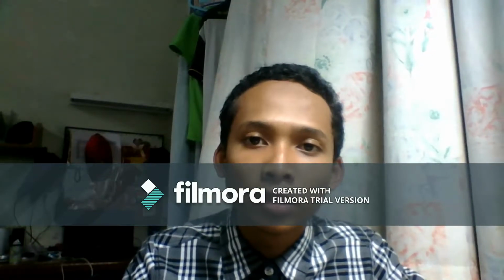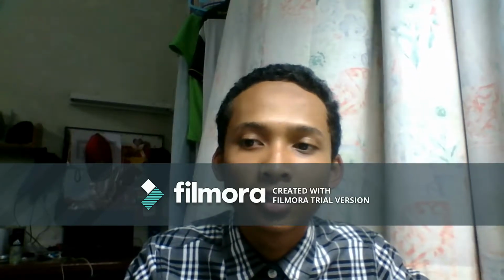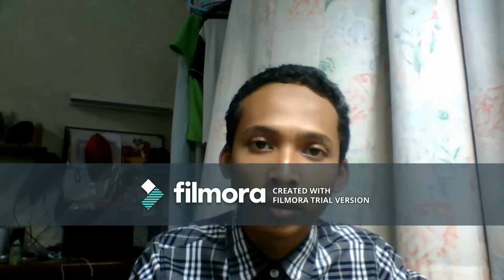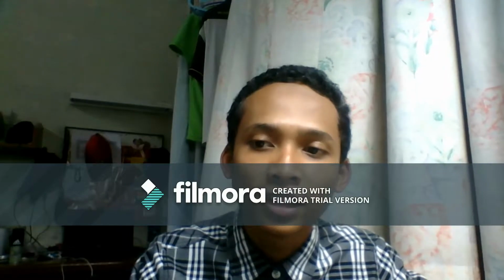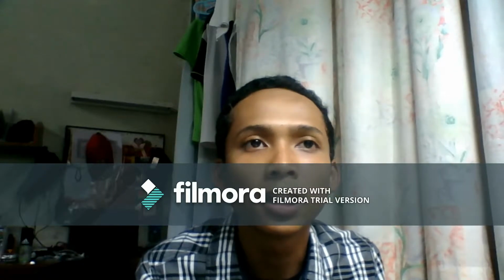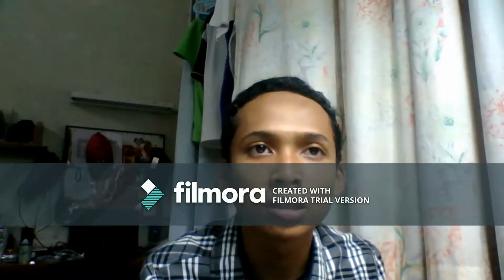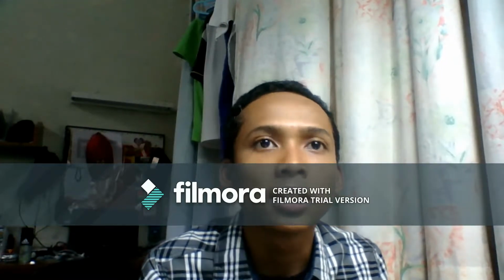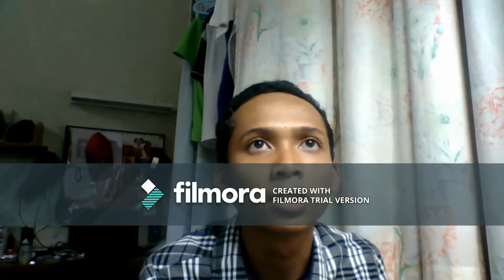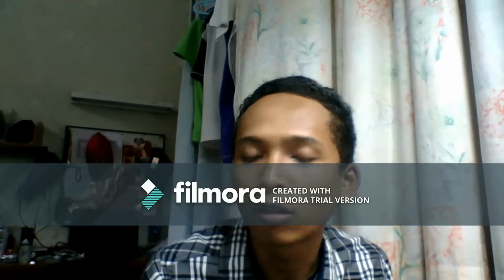Today, I will be presenting about identification tests for organic compounds. Please lend me your ears and I hope you will take note of my presentation because it will help you for the final. In the identification of organic compounds, there are a few types of identification tests: to distinguish alkane and alkene, the identification for alcohol, the identification for aldehydes and ketones, and lastly the qualitative test for carbohydrates.